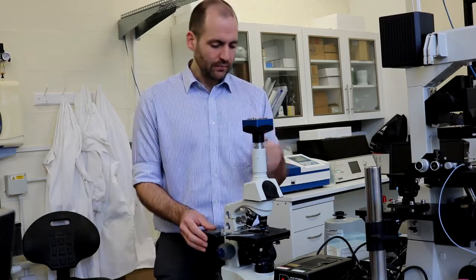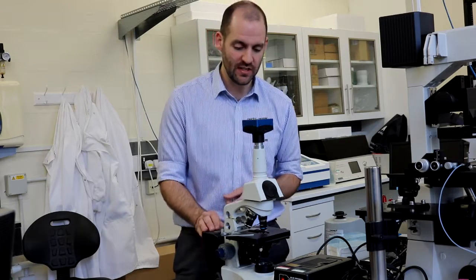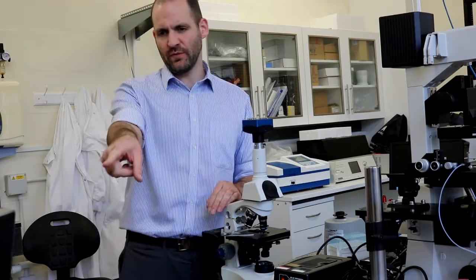difficulty. So by going out into the field with an entirely battery-powered setup, we can really look at things out in the wild that we can't grow in the lab because we don't know how. So this gives us new opportunities to study swimming microorganisms and biophysics of all sorts of living things in the field. The things we're looking at, actually, are in the top cupboard, the top of that fridge.